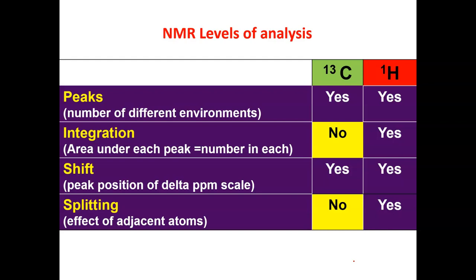The chemical shift scale, as we've seen already, is the same delta scale, but for Proton NMR, it's confined to between about 0 and 12 parts per million, unlike the carbon scale, which of course extends to over 200.